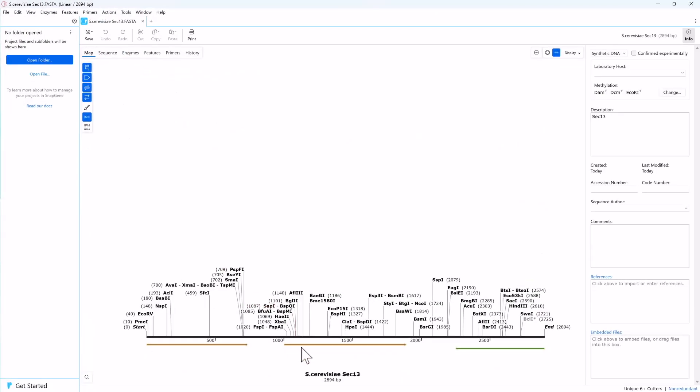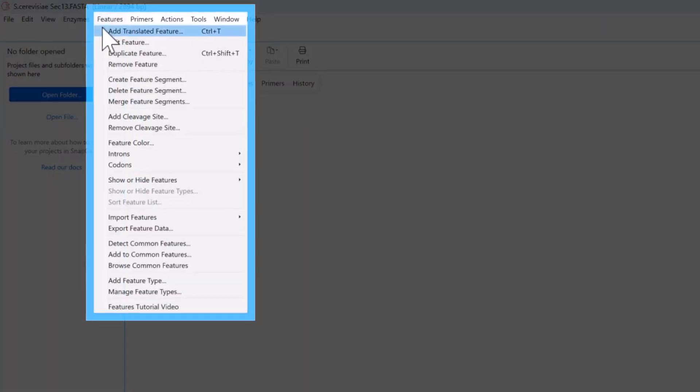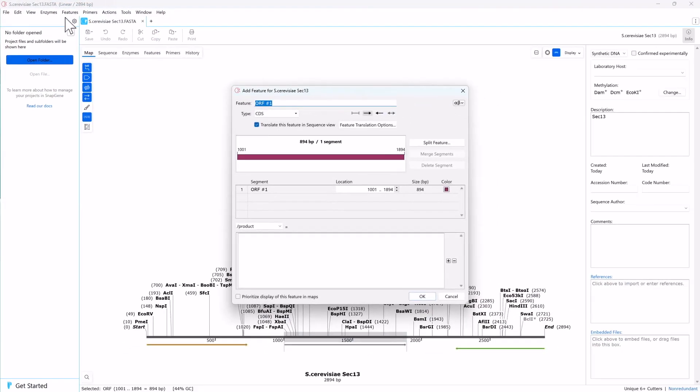Click on the predicted open reading frame to select it, then go to Features and Add Translated Feature. Give the translated feature a name.